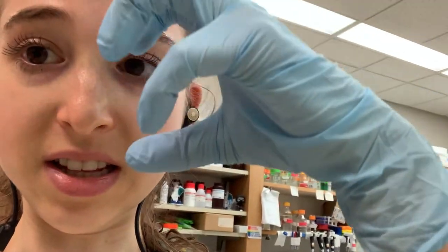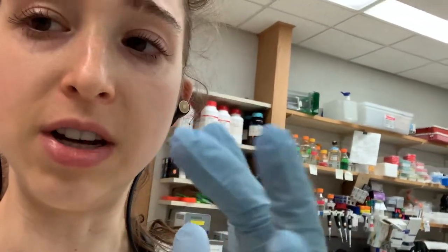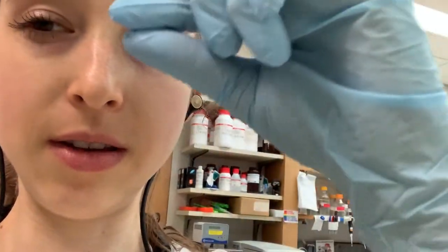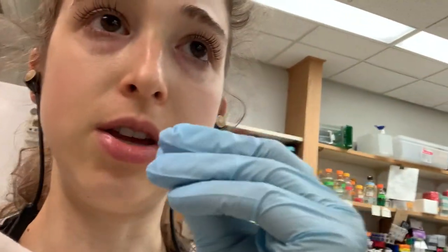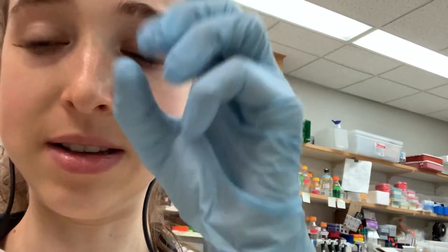Typically I aim to load around a microgram of protein. A lot of times I don't calculate exactly — I just know from past purifications how much to expect. If you overload the gel, you're going to get a smear or a giant blob that warps everything else. If it's the beginning of a purification, you have a ton of different proteins, so you can load a higher total amount because the individual bands will each be less concentrated. But if it's a single protein at high concentration at the end of a purification, it'll just warp your whole gel.